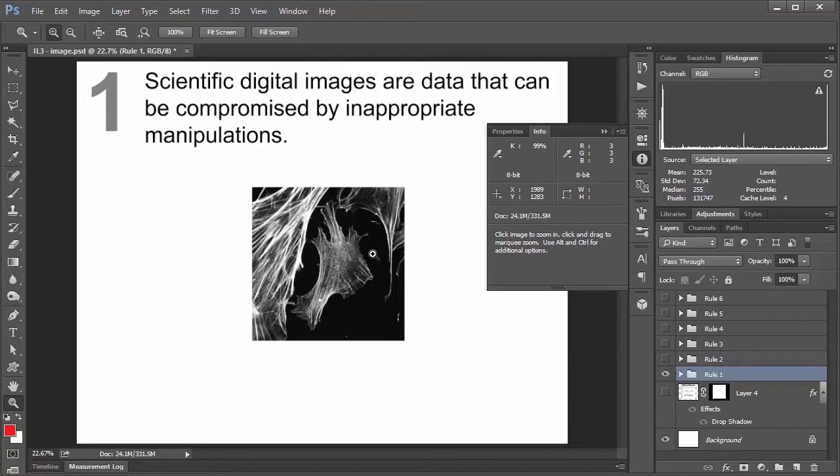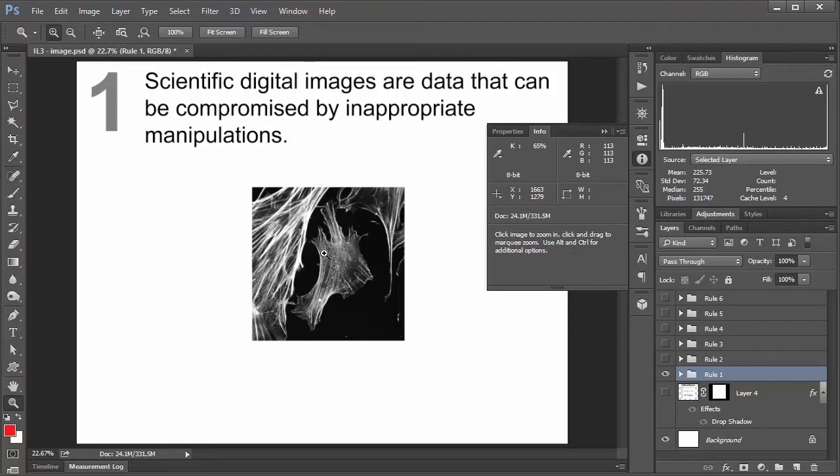So you can think of it like if you had a data set in Excel, if you're going to go and transform the data some way, you would apply the same transformation to your entire data set and not just a couple of the values. Same goes for an image. If you're going to be manipulating the image, you want to make sure you're applying the same transformation to the entire image and not just a part of it.